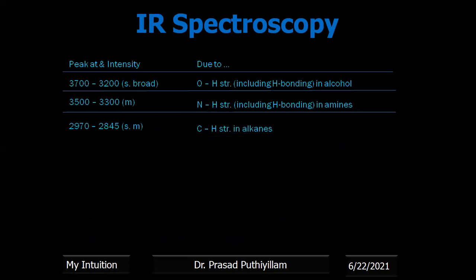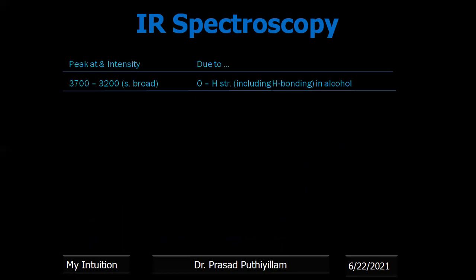Okay, so this is the conclusion of this particular class video, on how to identify different functional groups. Around 3700 to 3200, if you get a strong broad peak, that is characteristic of alcohol.